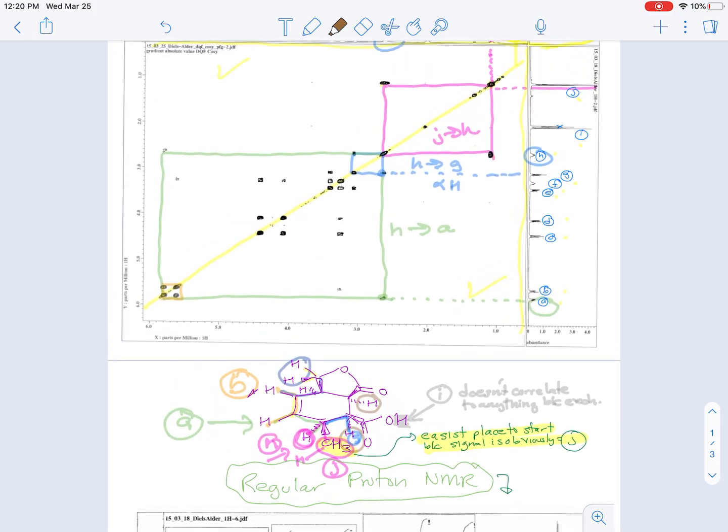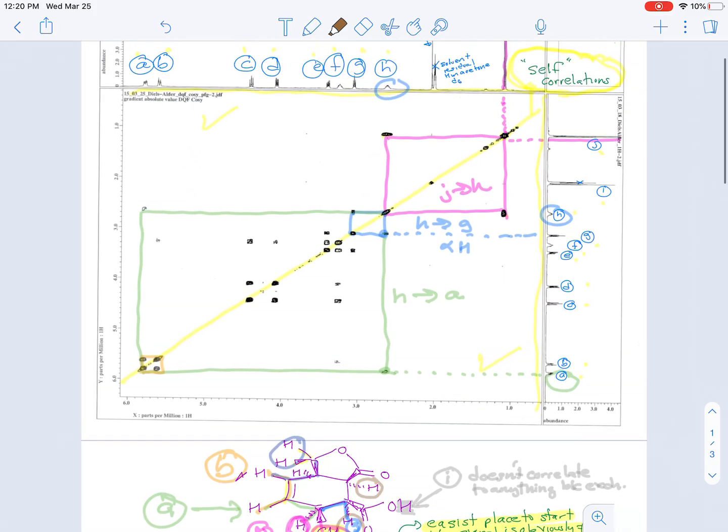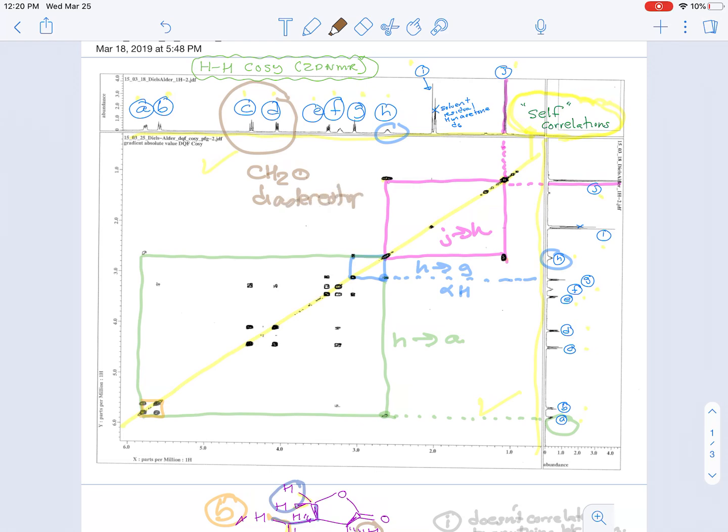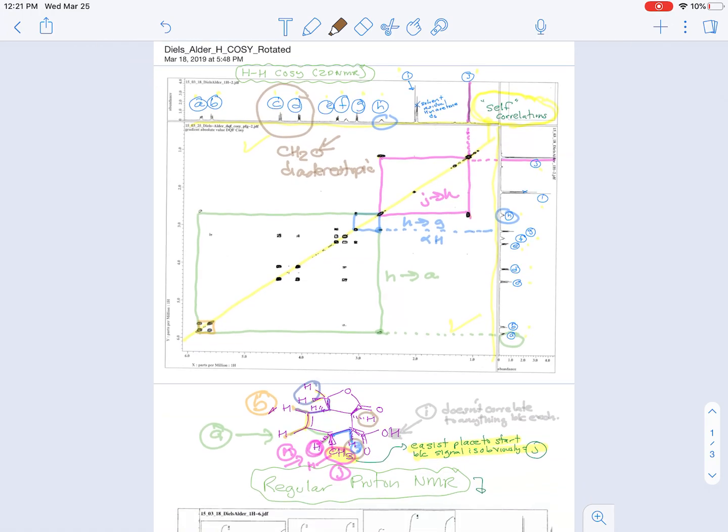So if you continue the process that I've done here, you're able to assign all of the hydrogens except for two, and the two hydrogens that you can't tell from each other are these two, which are the diastereotopic hydrogens that are the methylene that's next to the oxygen. And there are other types of spectroscopy that can be used to figure out which one is C and which one is D.